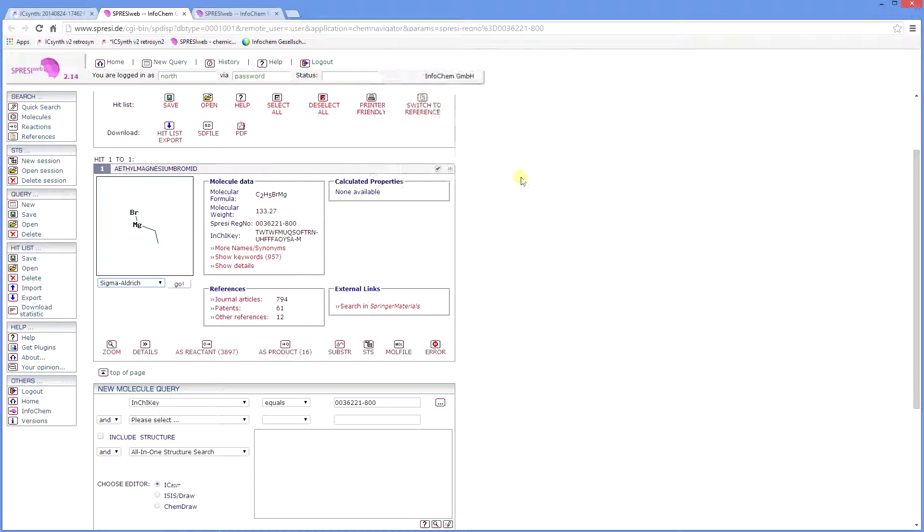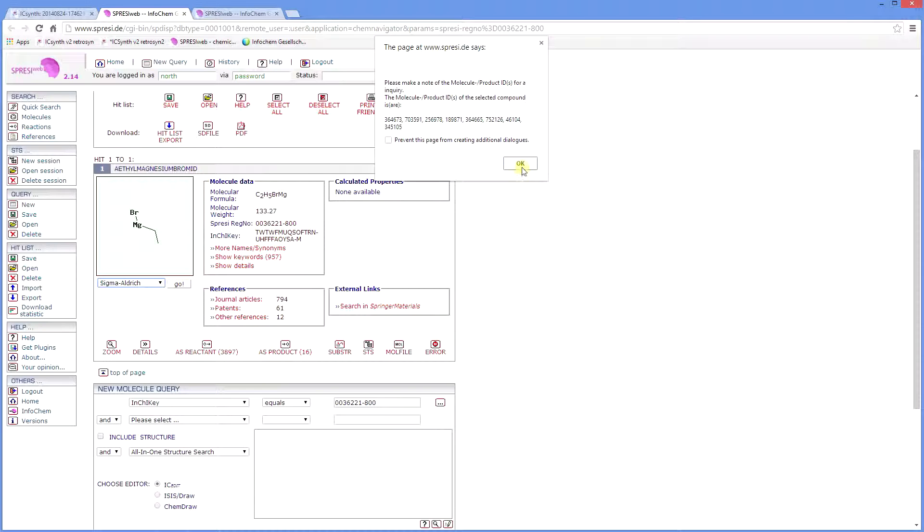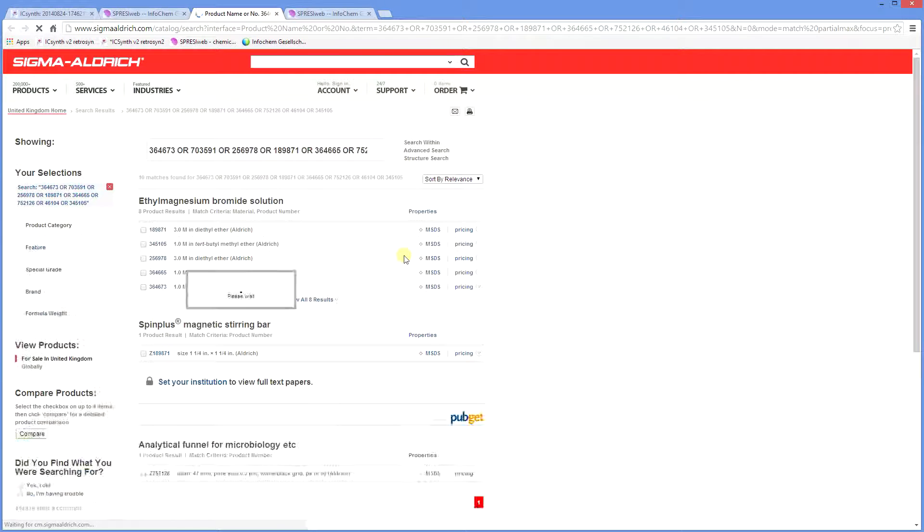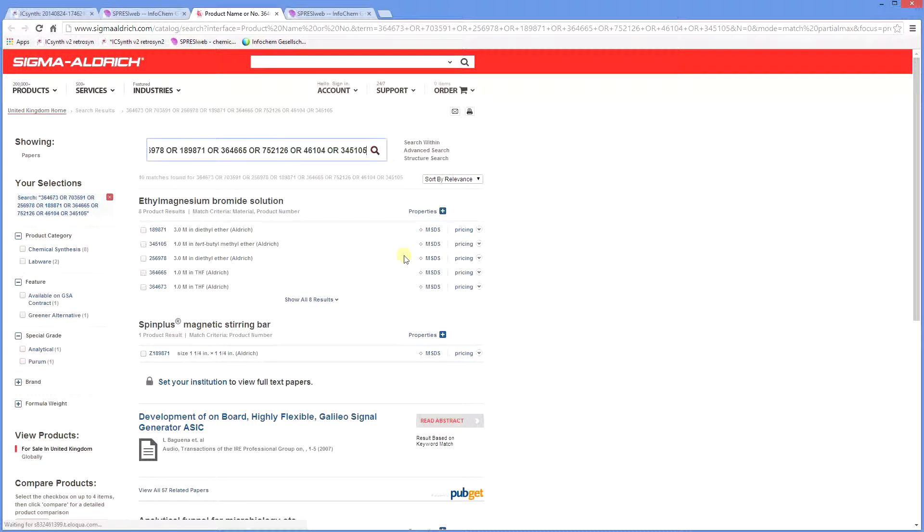In this case, Sigma Aldrich is selected and we now link to their website and can view the purchase information.